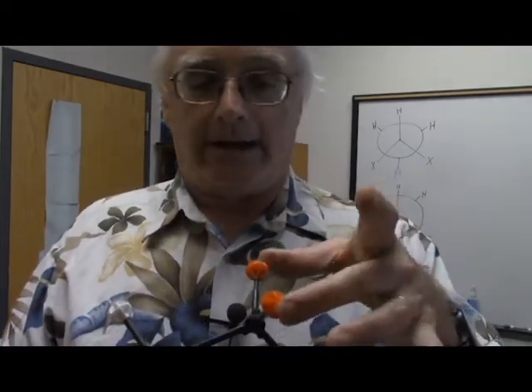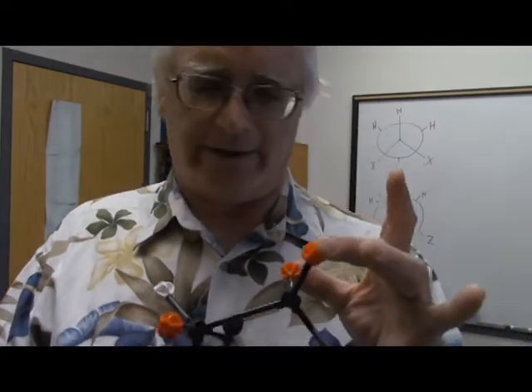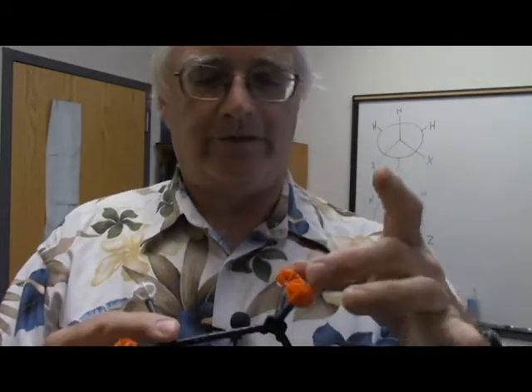Oh, it's just beautiful. Now, why is it a second order doublet of doublets for these two protons? Mainly because the chemical shifts are different, but they're not hugely different. If you have a chiral center right next to the CH2 group, you'll often see the CH2 groups have different chemical shifts. Sometimes in cyclic molecules like menthol, it can be a whole ppm or more. Here, it's much smaller than that, but it is definitely measurable. Remember, you see your second order coupling patterns if the chemical shift difference between these two, which is small, and the coupling constant are on the same order of magnitude.